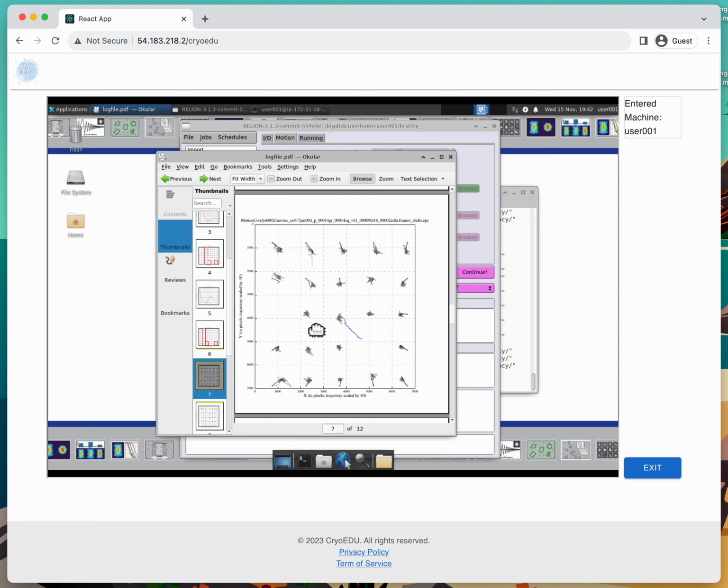And so the trick with patch-based motion correction is they are trying to balance information from the global alignment with local alignment. At one extreme, every trajectory is exactly the same as the global, which means you didn't really do any local motion. At the other extreme is you are just focusing on single particles moving through, let's say, a movie, which is very noisy and hard to be confident in the tracing. And so what these programs will do is some kind of combination of weighting local neighbors and the global to give you a more accurate patch-based motion.